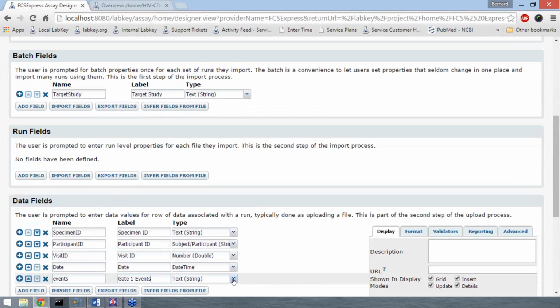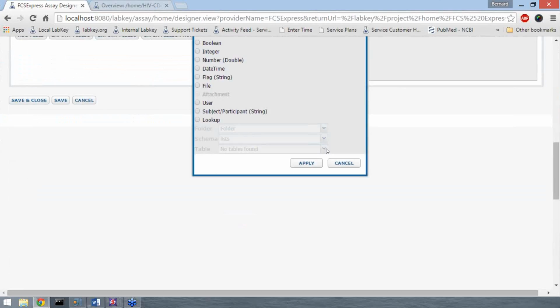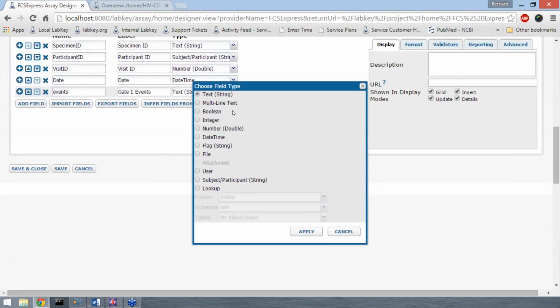And then we get to choose our data type. LabKey offers a number of options. In this case, of course, we're counting individual cells, and we're interested in integers. But you can set it as a string type, date type, as well as files, such as the histogram that Kaya showed before.